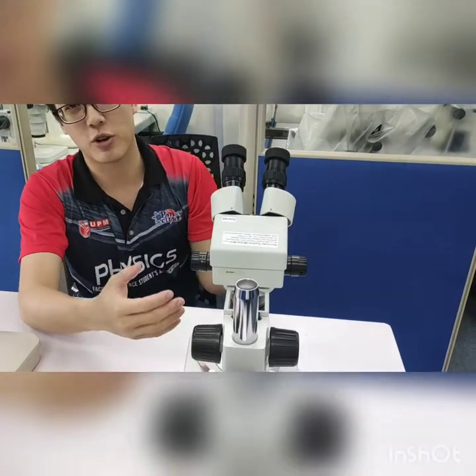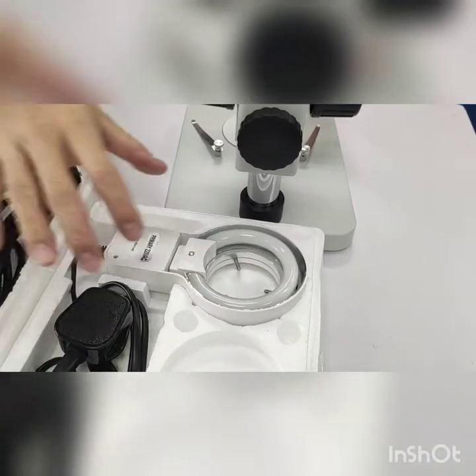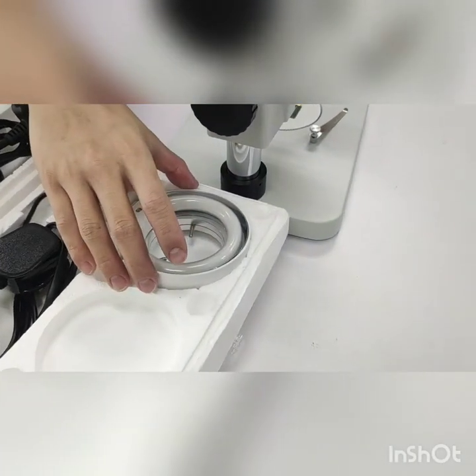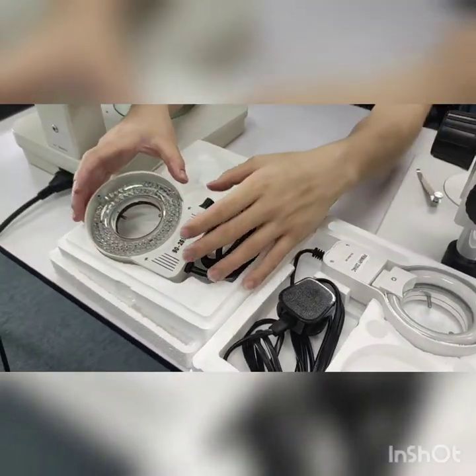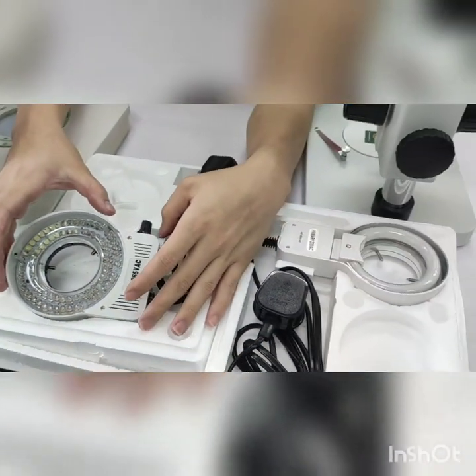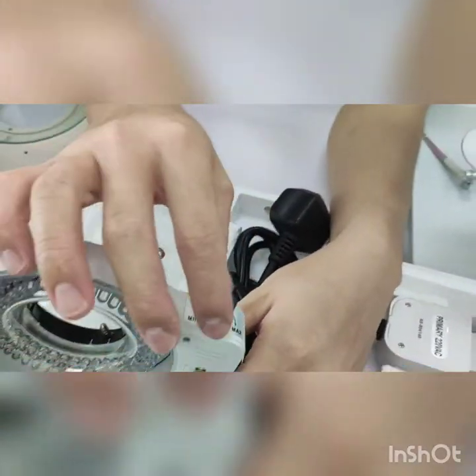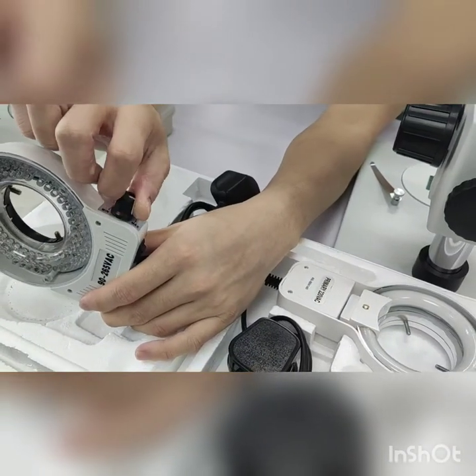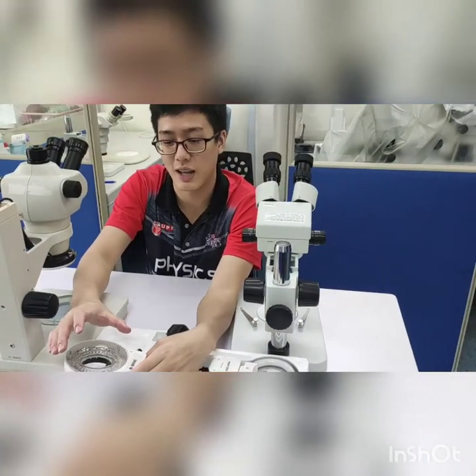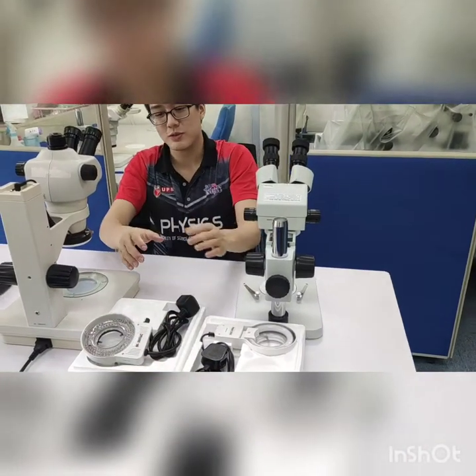When we use a microscope, of course we have to have light, right? I have put the lighting out here. We have two kinds of lighting. The first one is this conventional fluorescent light. Next, this one is called the LED light, which is a more modern one, of course. Using the LED light has two advantages. First, we can adjust the intensity from lower power to higher power. Other than that, we can also save more energy by using the LED light. So this is about the lighting.